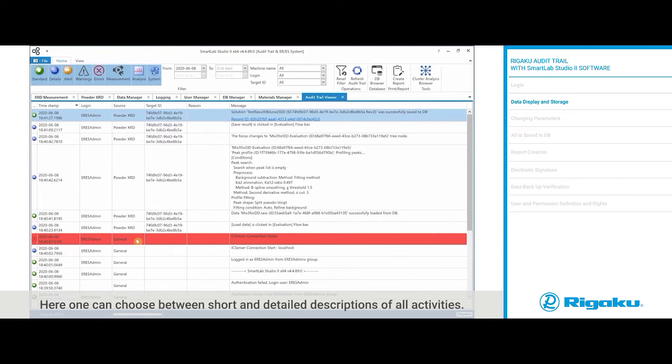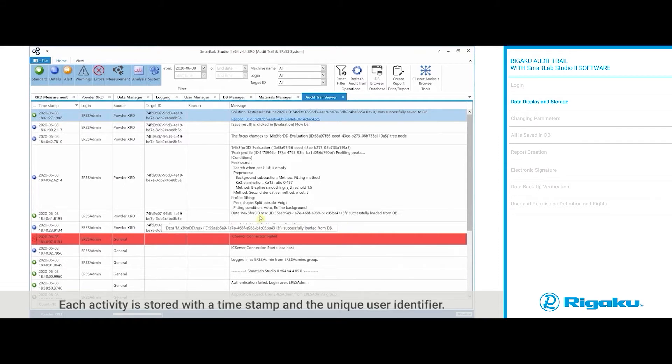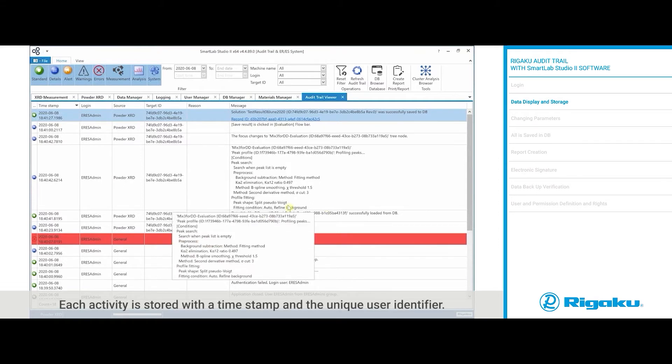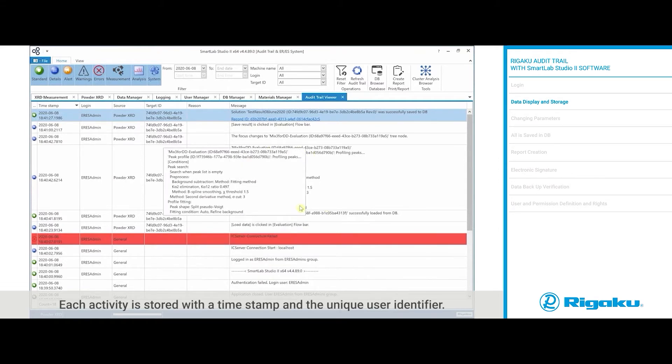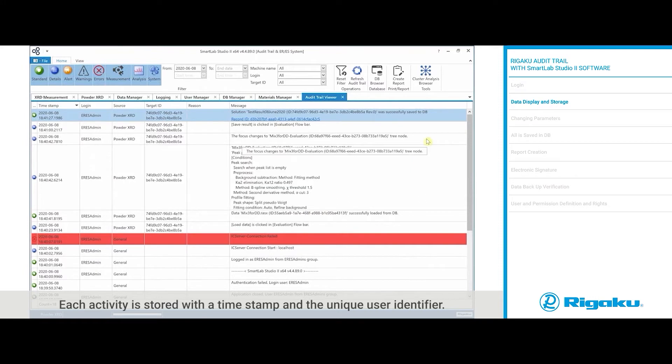Here one can choose between short and detailed descriptions of all activities. Each activity is stored with a timestamp and a unique user identifier.